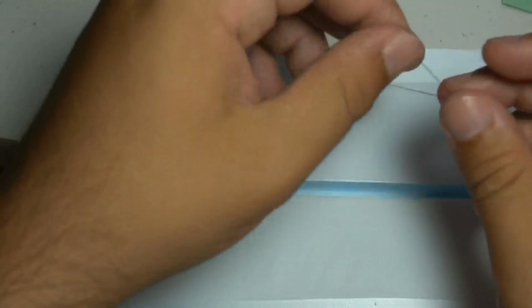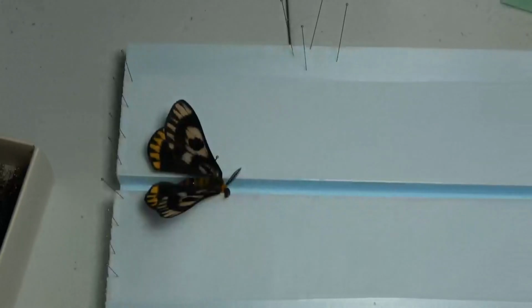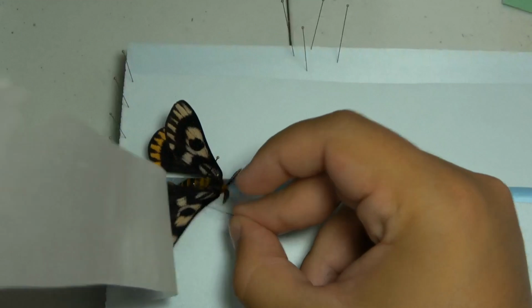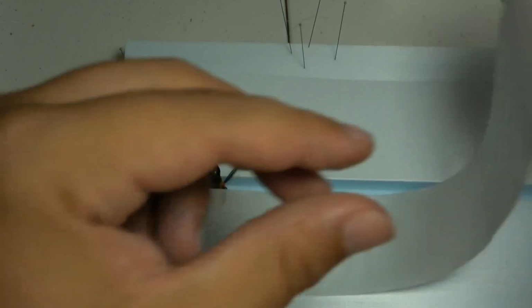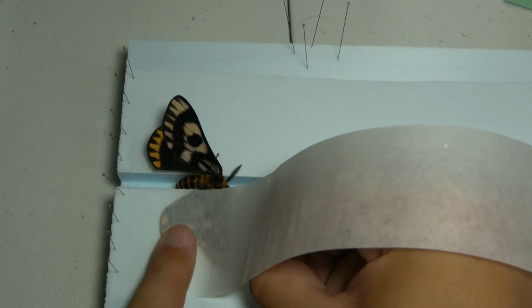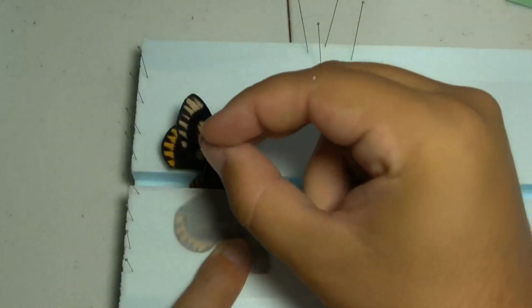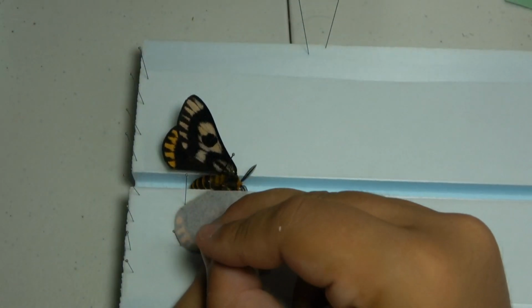To help keep the paper down on the wings and secure the wings, I take pins. So when you move the paper up, just like that. My method, I pull the wings up like that, and I hold it down tightly with my finger. And I put pins around the hind wing. Like so.